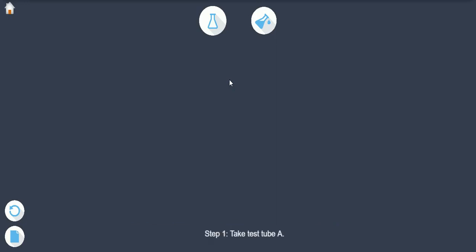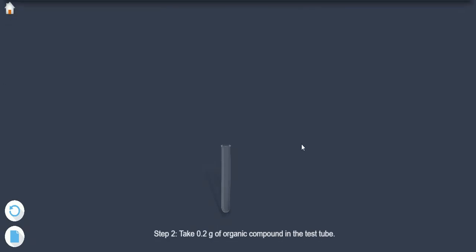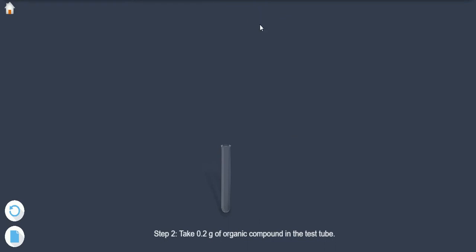Step 1: Take test tube A. Step 2: Take 0.2 grams of organic compound in the test tube.